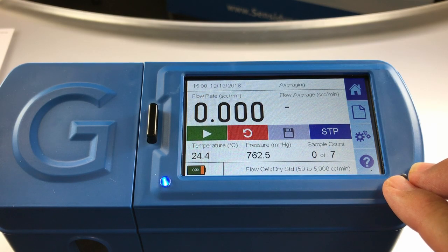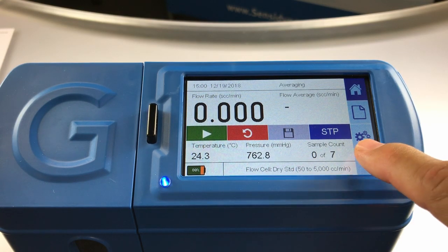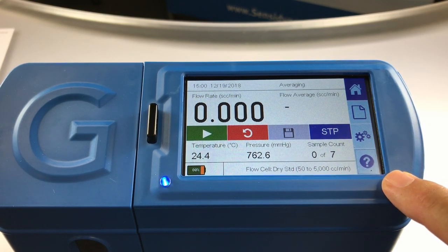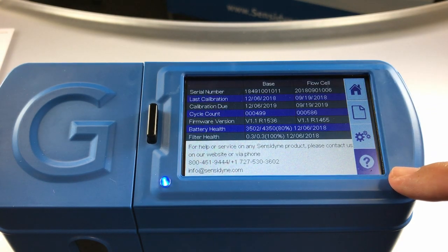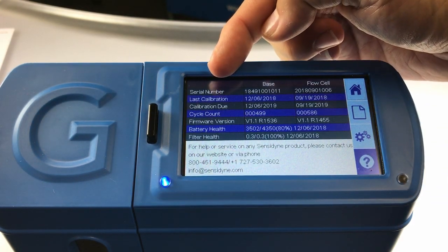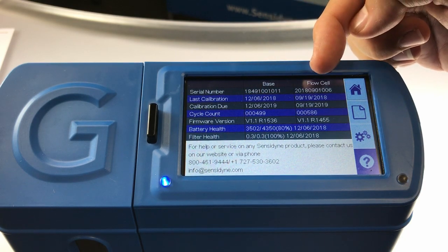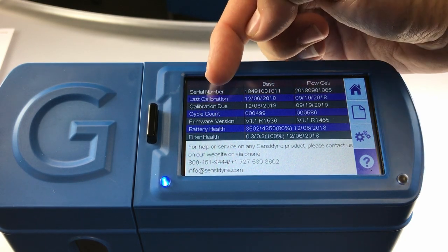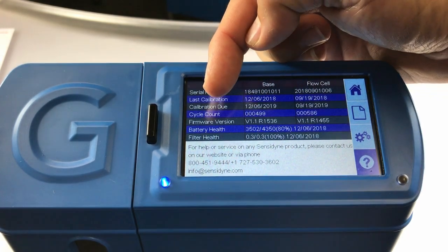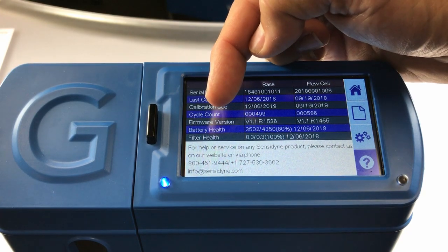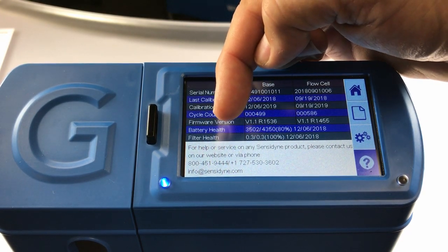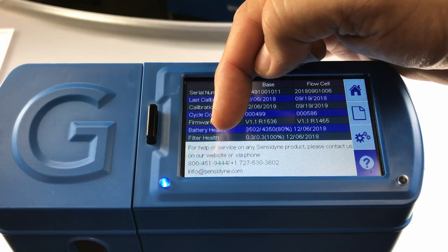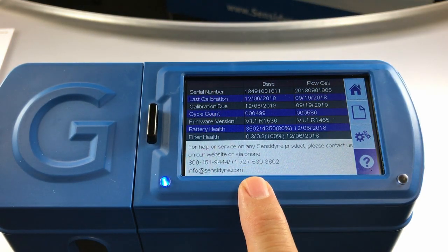And lastly on the vertical bar is the help screen button. From the help screen, you can see the following information: the serial number for the base as well as the flow cell, the last calibration dates, the calibration due dates, the cycle counts, the firmware version, battery health information, filter health information, as well as information on contacting our service department.